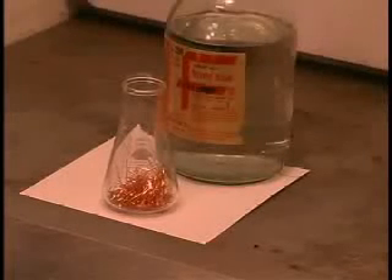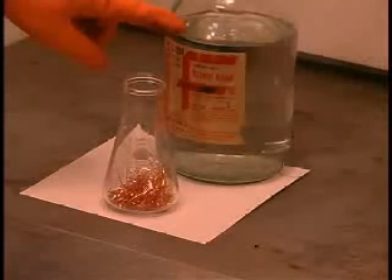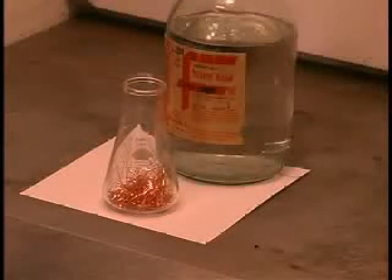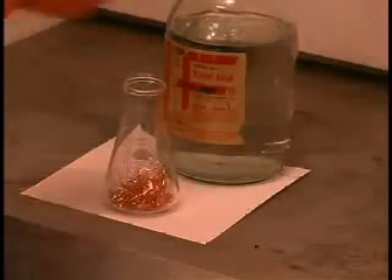We're going to perform another reduction oxidation reaction here. We're going to pour concentrated nitric acid onto some copper wool — that's just solid copper in a finely divided form.